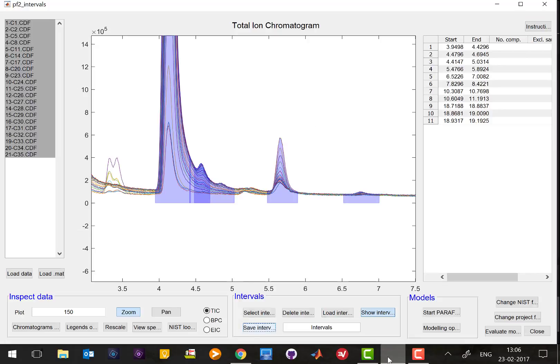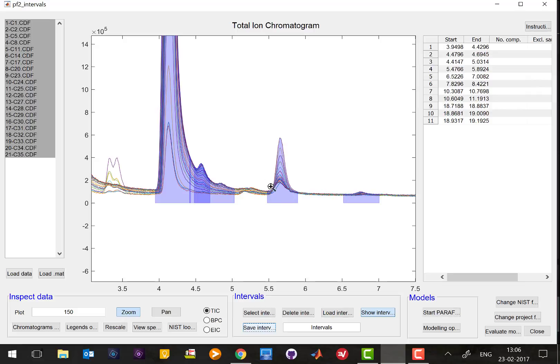Now we have defined intervals and what we will have to do now is that we need to resolve what is going on in each and every peak. What that means is that we're going to use a model which is called PARAFAC2 to investigate in this particular peak how many different distinct chemical profiles are there.